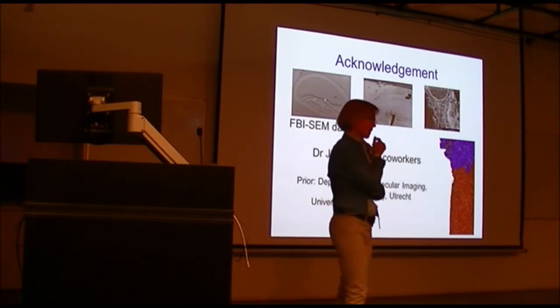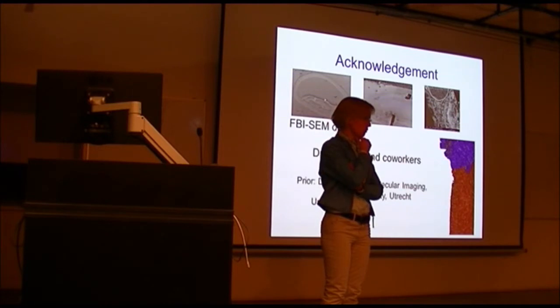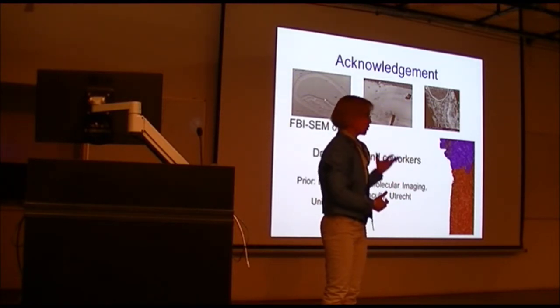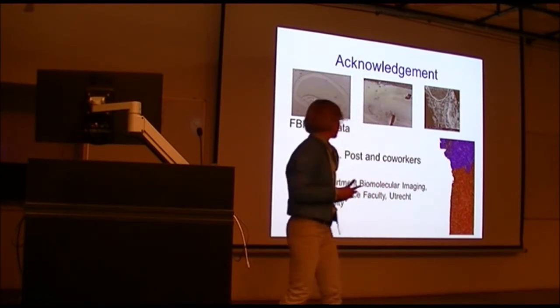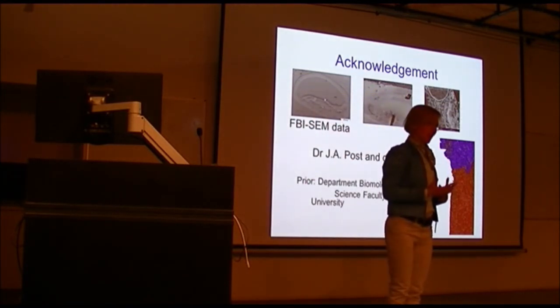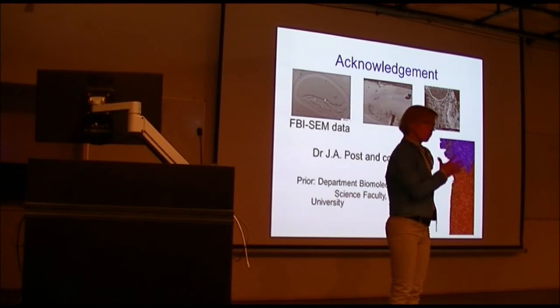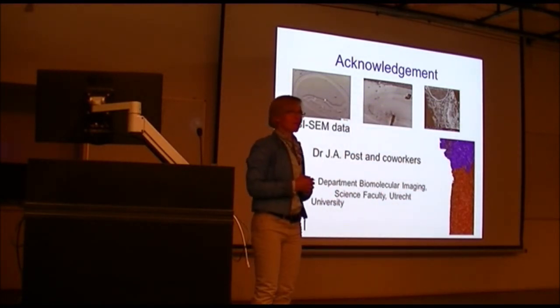No, I think actually this new technique is one of those. It was not possible before to make three-dimensional structure pictures. This technique in biology now exists for 6 years. It was used in industry already for a longer time, I think to produce conductors, something like that. So it exists already for 20 years, but to apply it to tissue is an enormous challenge, because you have to prepare the tissue such that the picture you see is not changed from the real life situation. That took a long time to get. But I think this is one of the most exciting. I'm a person in this field for 30 years, and this is something where I really get excited.